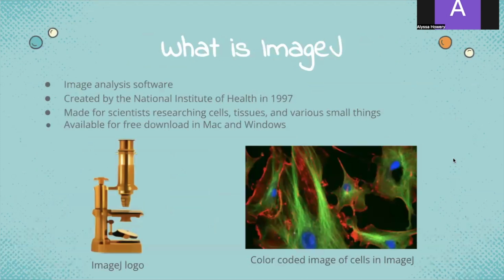Created by the National Institute of Health in 1997, the software was originally aimed to aid scientists who are researching cells, tissues, and similar stuff, but it has proven useful for a wide variety of other occupations like engineers, photographers, and even those who use it just for fun since it is free.